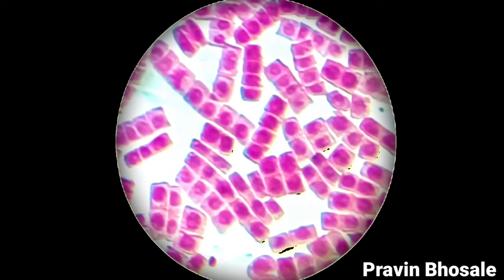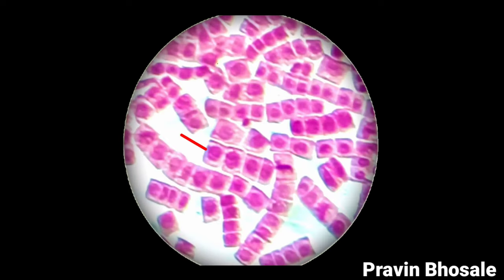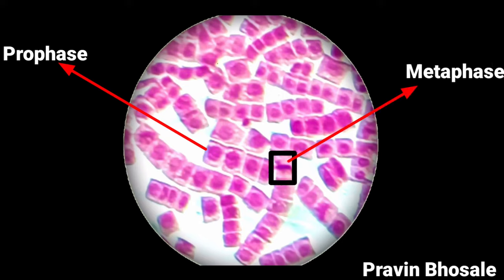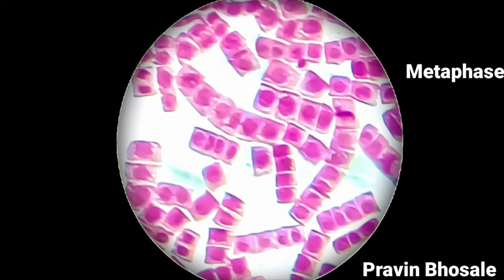Now let's see the stages. This is prophase, and here you can see metaphase. In metaphase, the chromosomes are arranged at the equatorial region — the chromosomes are in the center of the cell. So this is metaphase.